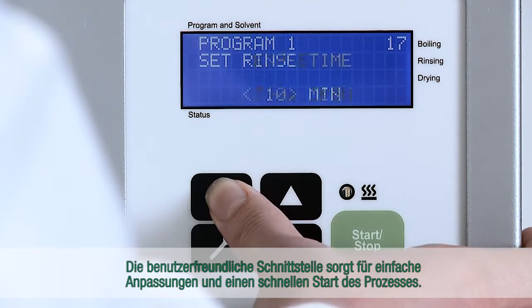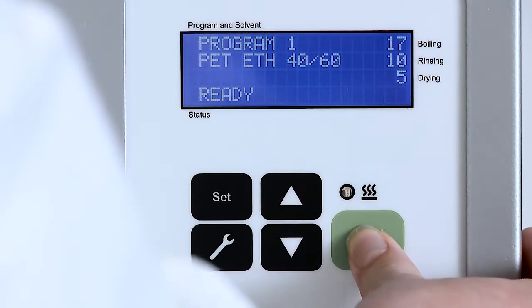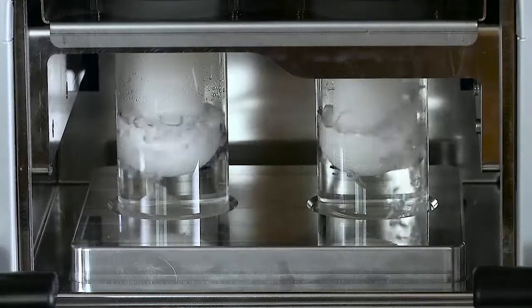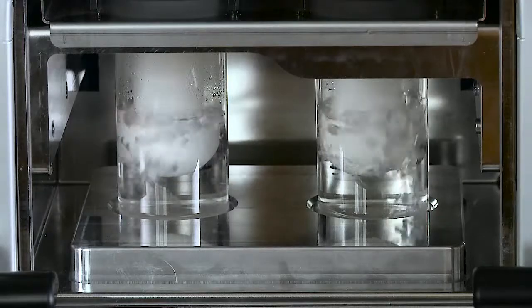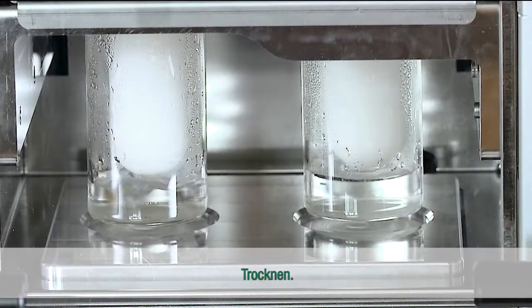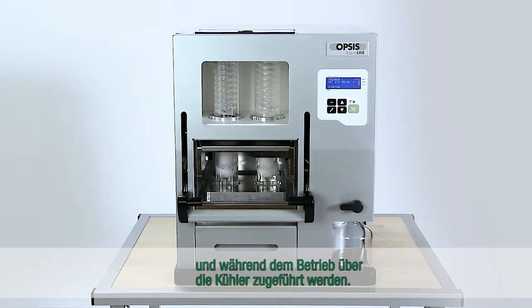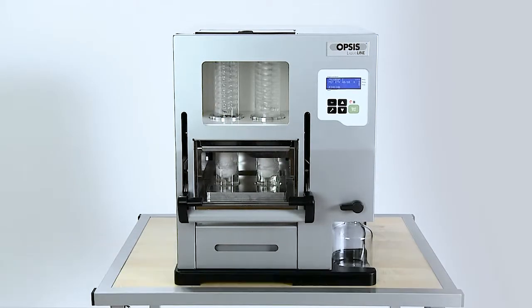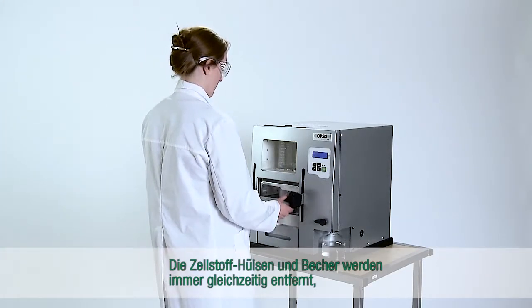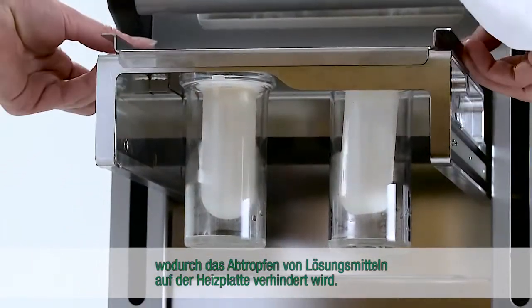The user-friendly interface ensures easy adjustments and a quick start of the process. Soxrock handles all steps automatically: boiling, rinsing and drying. The solvent can be added in a closed environment and during operation via the condensers. The cellulose thimbles and cups are always removed simultaneously, which reduces dripping of solvents on the hot plate.